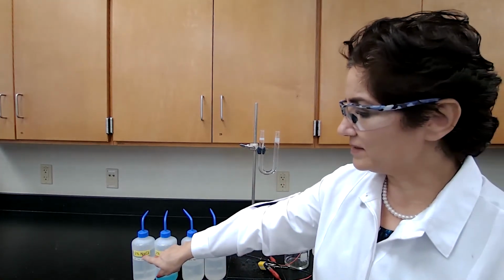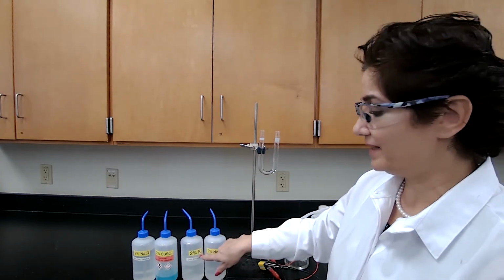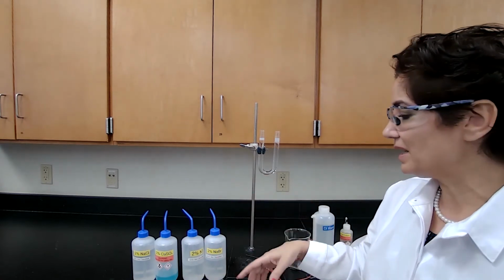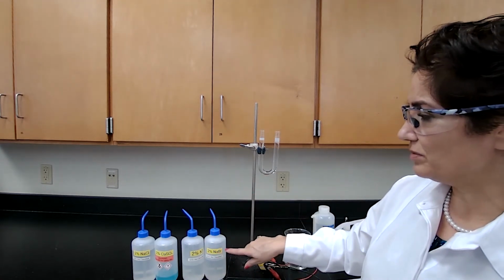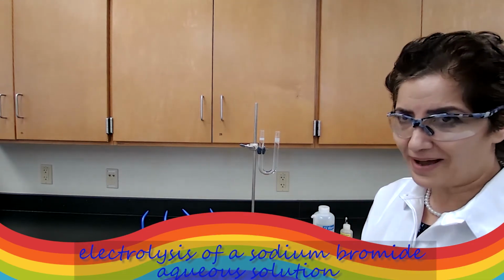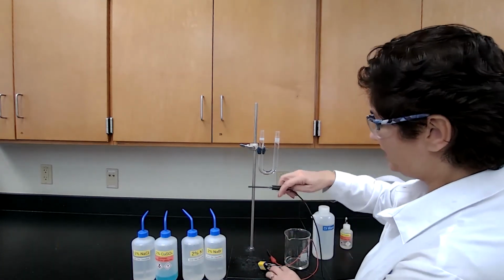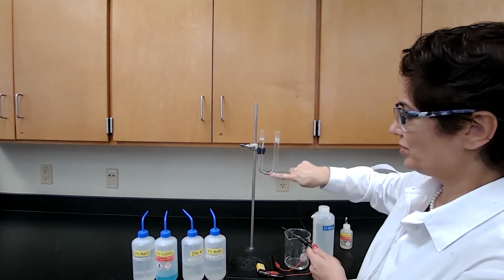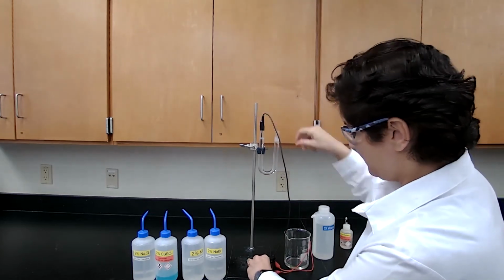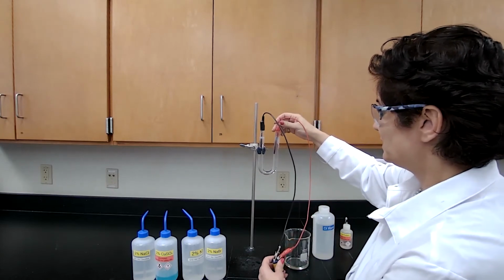Okay, we tested the sodium chloride solution, cupric sulfate solution, potassium iodide solution. The last solution for this experiment, which is part B of the experiment for electrolysis, is the sodium bromide. By now, you should already know the pattern. What do we expect? Metal can be reduced or water can be reduced. I added the sodium bromide and a few drops of phenolphthalein. I'm going to connect the graphite electrode and place it in the solution.